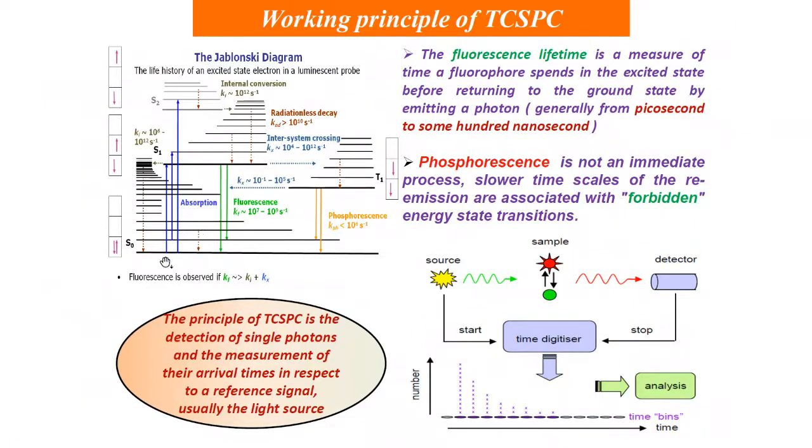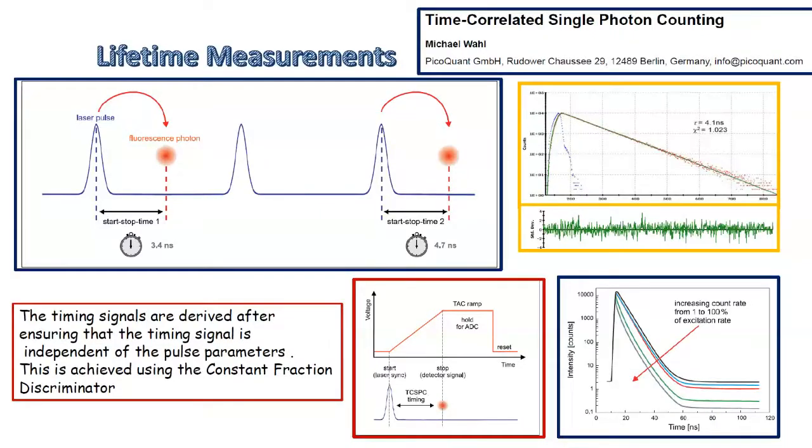So the basic principle is you excite something, and let it de-excite at a time level where you can measure. This gives you all kinds of fascinating information. So what you would have is a repetitive pulse as your source of excitation. It sets up an excitation and then you will start your decay.